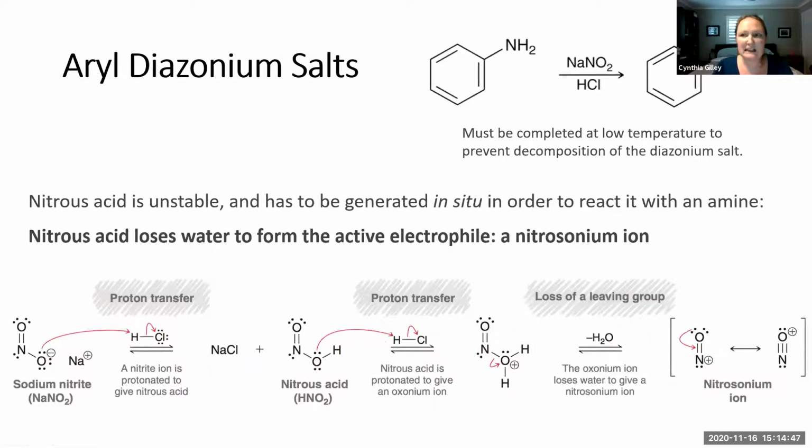So how did we get the diazonium salt? Right? The diazonium salt comes from a process called diazotization, and it starts from an aniline. The aniline is treated with sodium nitrite and aqueous HCl, and the diazonium salt is prepared. Typically, it's used immediately, so it's prepared in situ and used immediately by either reactions such as the Sandmeyer reactions that we talked about in lecture, or in the azo coupling process.